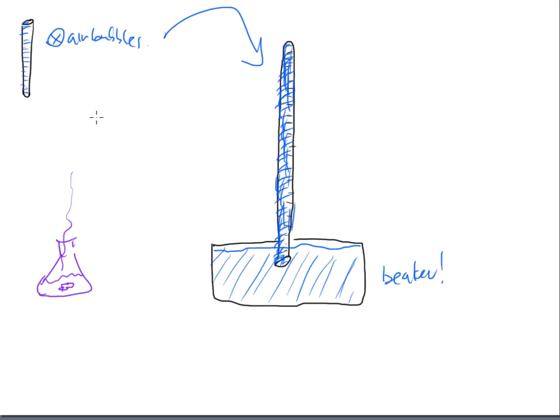All right, so we got to be careful, and we often will see in those diagrams a rubber stopper that will be plugged up here at the top, and then there'll be a piece of glassware that will be bent, and that glassware will bend down and get submerged under the water. And then that piece of glassware will come back up and it will be pointed inside of the eudiometer. All right, so you need to think of this piece of glassware as having a lot of kinks on the ins or on the outside, so that way it will fit into this beaker or container the proper way, and it can be directed into the eudiometer the proper way.